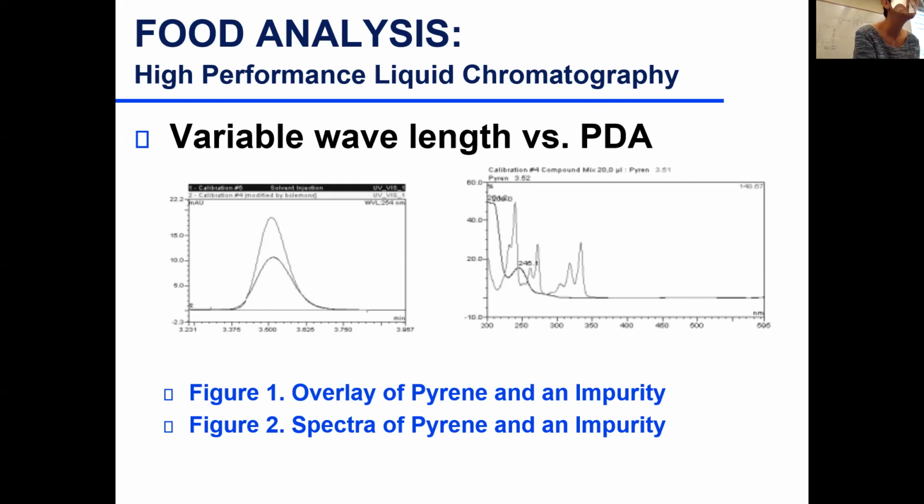Okay, so if we're able to get separation, then you'll get two peaks. For every individual peak, one peak will have its own absorption, and for the other peak, we're going to see its absorption. So these will separate if we get separation.